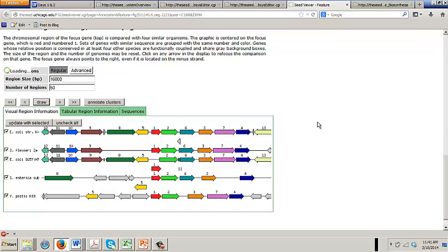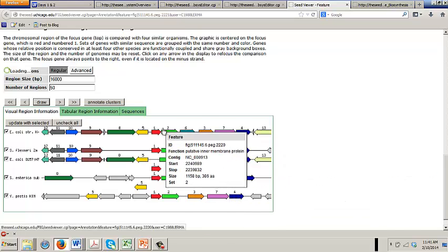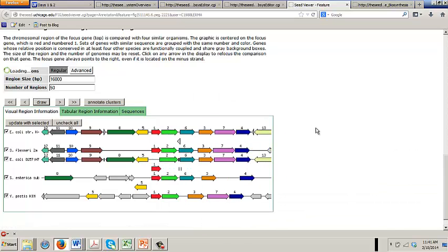It's looking for the closest homologue, the next closest after that. And it's simply putting either side of that gene, adjacent, 8,000 base pairs. If they have the same color, it means they have their homologue. But if the homologue is on another chromosome or something, it wouldn't go out. No, it's just putting in the block of genes, the block of DNA, whether there's genes in it or not, either side of your gene of interest.